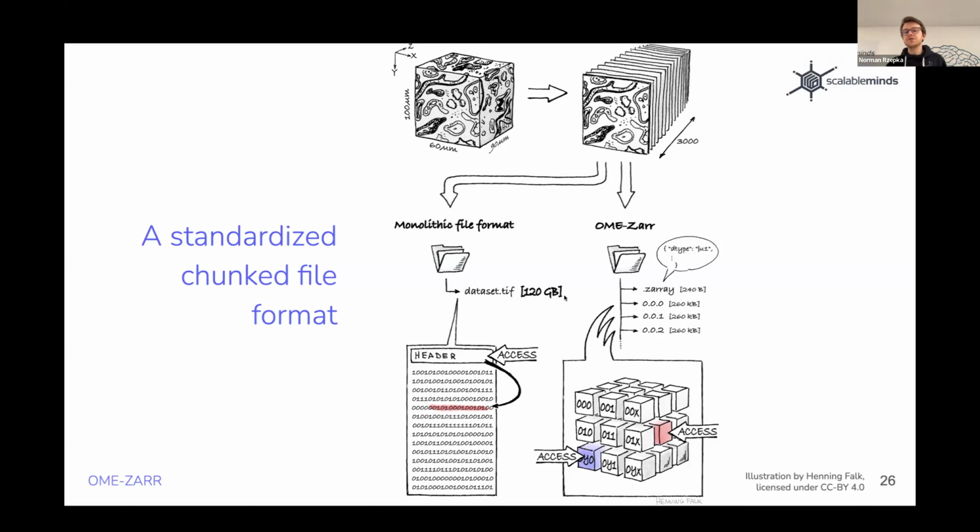For one, because most of the time you need to either import the entire data set into main memory, and with 120 gigabytes, that might be fine. Some computers have that much memory, but a regular laptop doesn't. Or you have the data oriented in sections where you can only load individual sections, and that really is a bottleneck if you want to do 3D analysis.